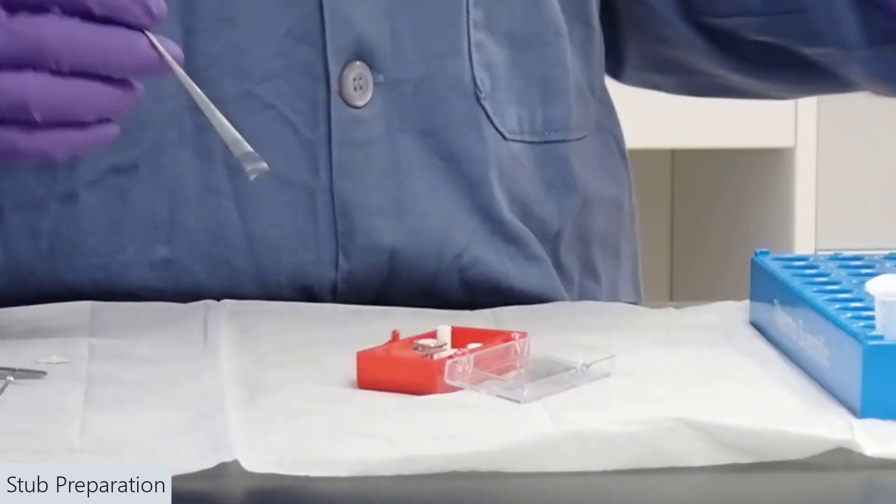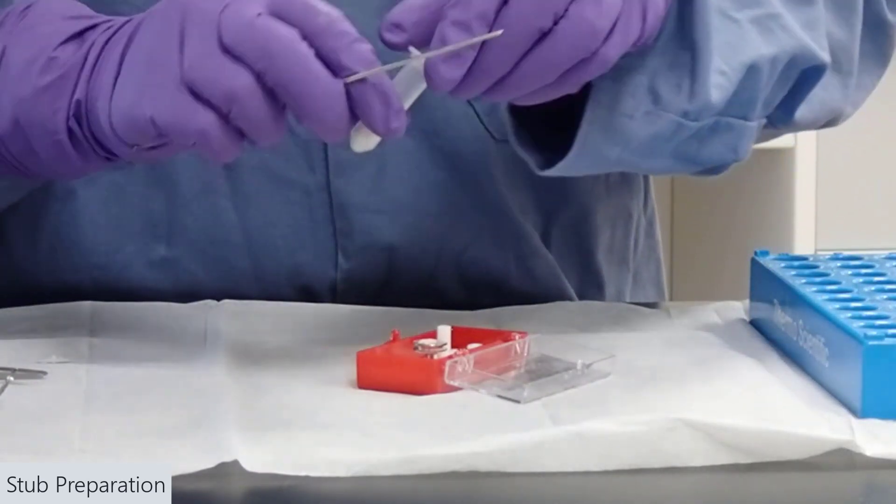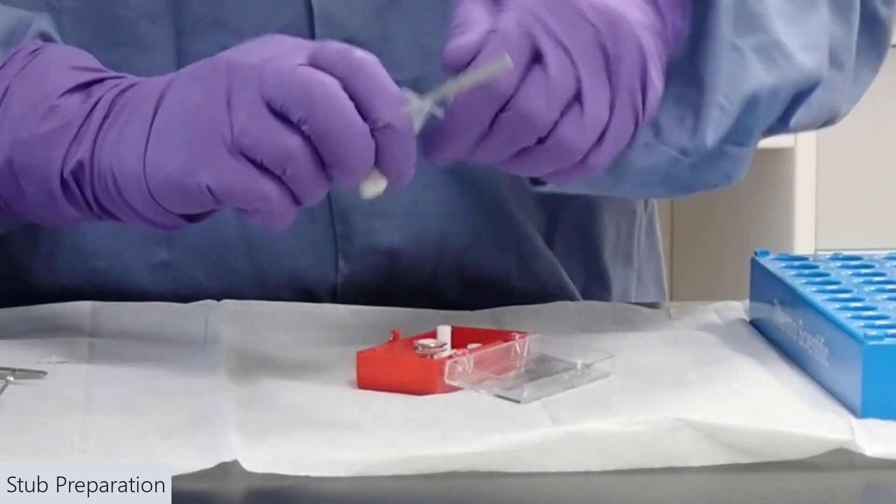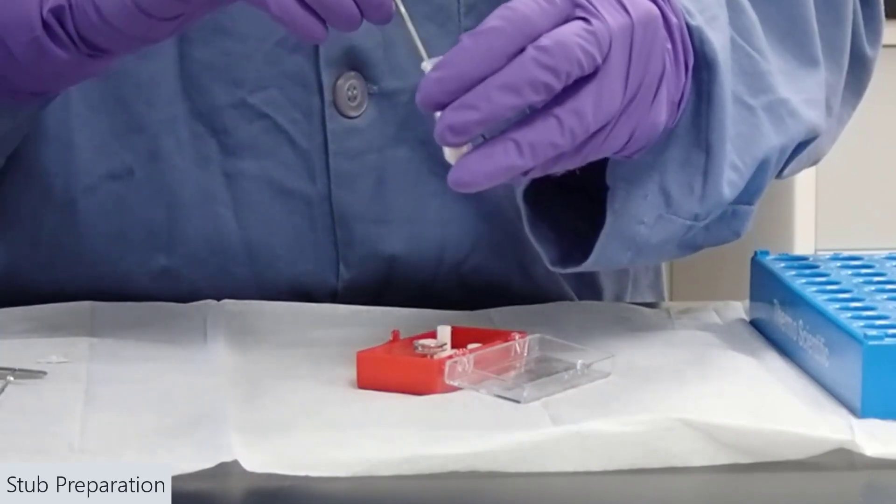Next, we're going to use the scoop to take a small amount of powder and put it on the double-sided tape. Smaller is better in this case.